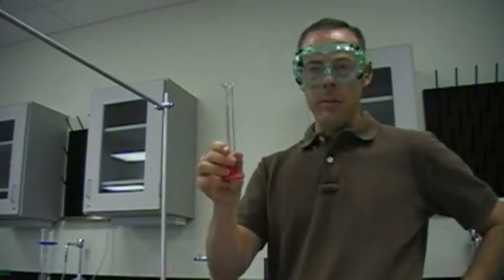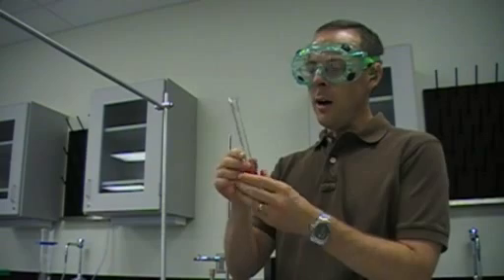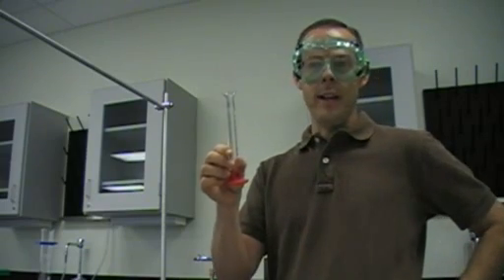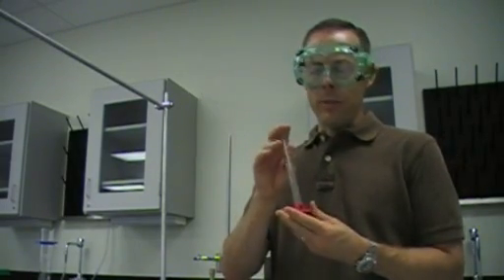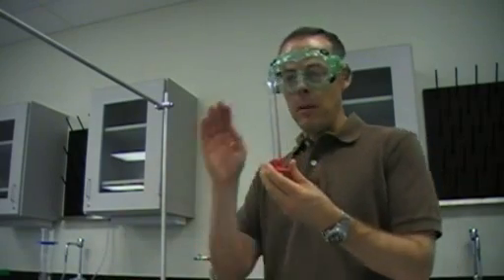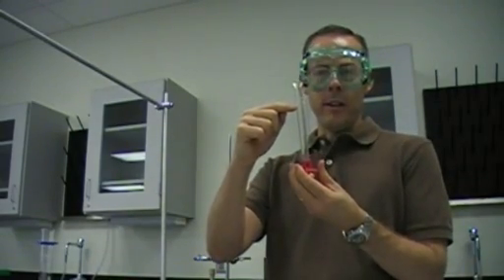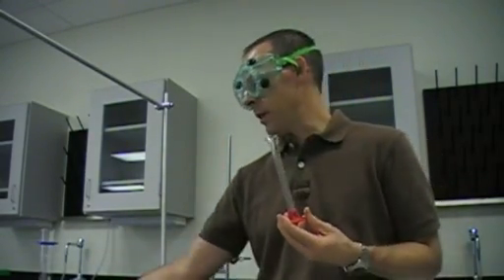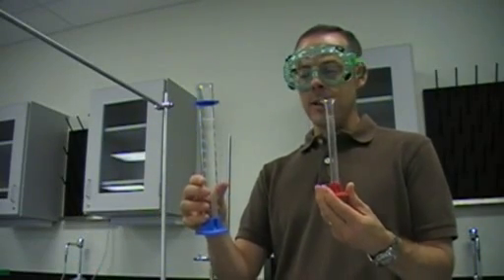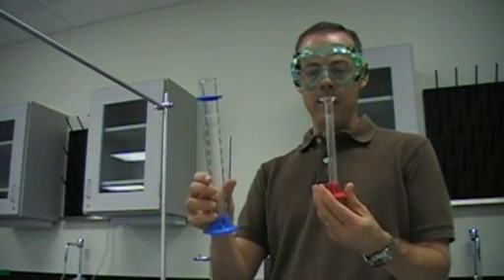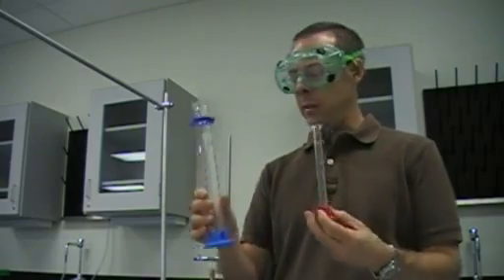What's even more expensive are typically 10 milliliters. Each of these lines represents one tenth of a milliliter. So if I want an accurate measurement, I'm going to ask you probably for this. If it's a liquid that takes more than 10 milliliters, if I accurately need 45 milliliters, then you would use a graduated cylinder.